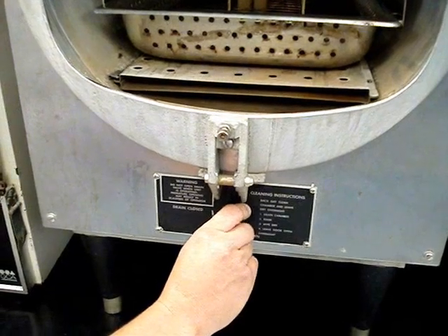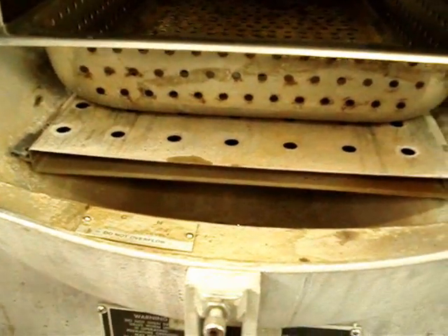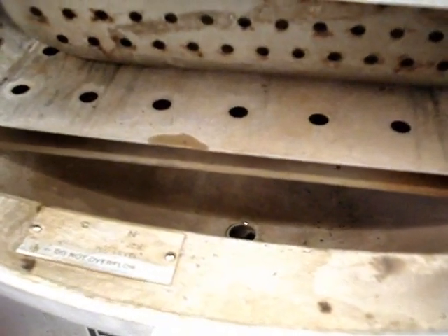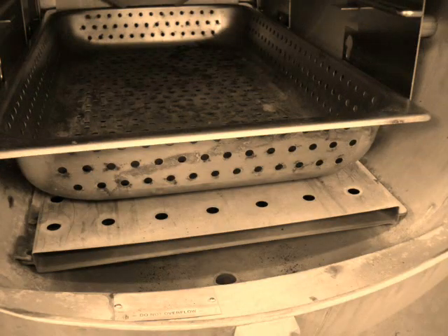Después de haber utilizado el autoclave en tu jornada de trabajo, debes drenar el agua del autoclave. Si vas a esterilizar material más de una vez, puedes usar la misma agua, pero rellenándola para mantener el mismo nivel. El drenado es importante para evitar la acumulación de sarro, y se debe dejar secar toda la noche.